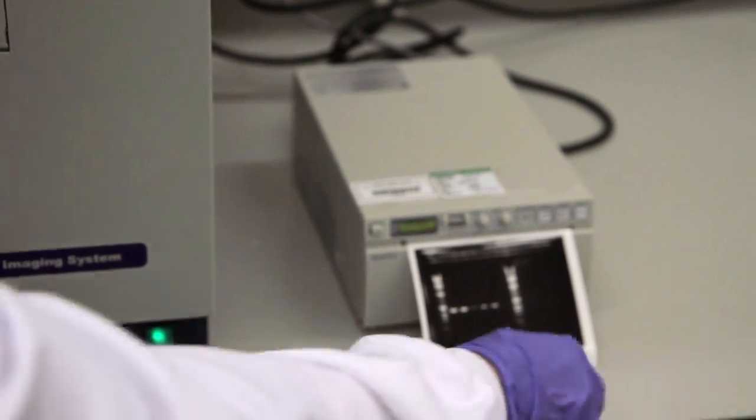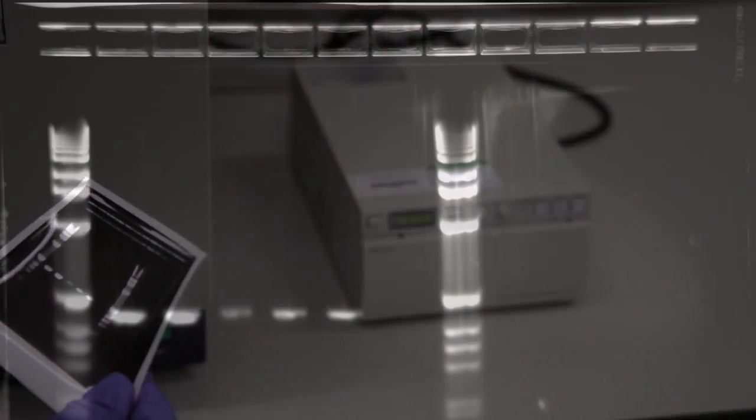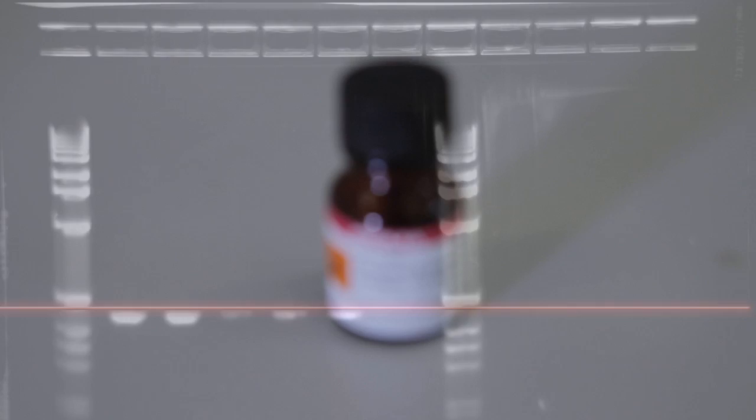Today we have used a 1 KB ladder. If your gel has run correctly, the size standard bands will have run at the same place in the gel. You can judge the size of your PCR products by imagining a horizontal line joining the bands on the markers. Then estimate the size of your products against the closest band in your size marker.